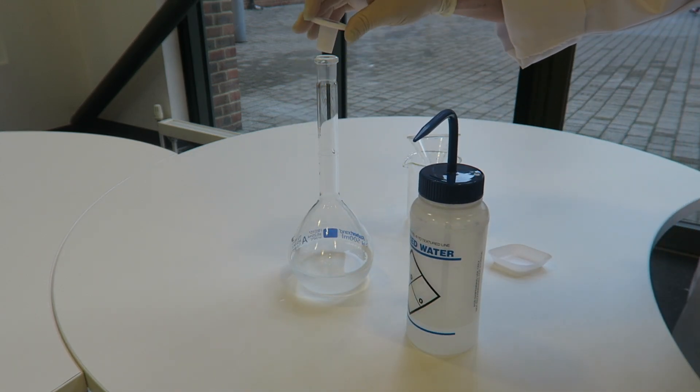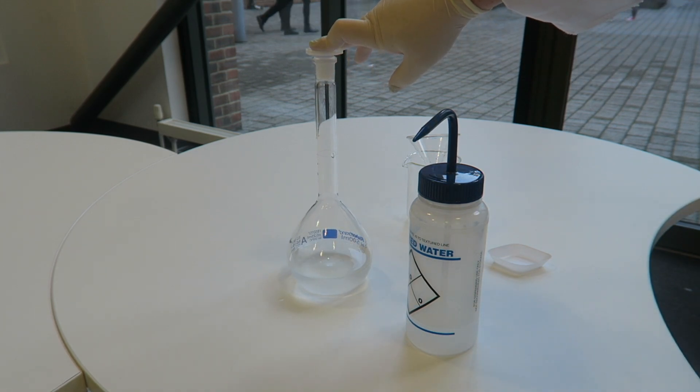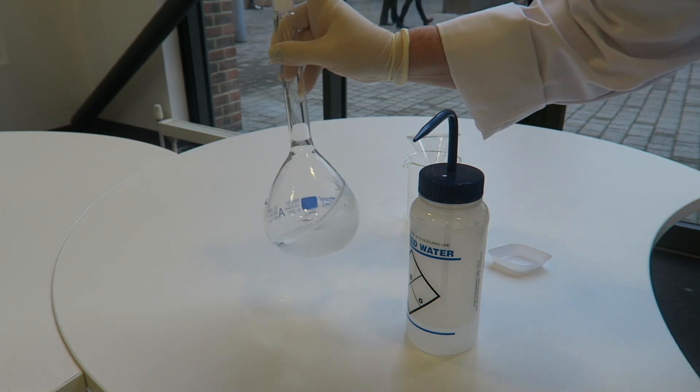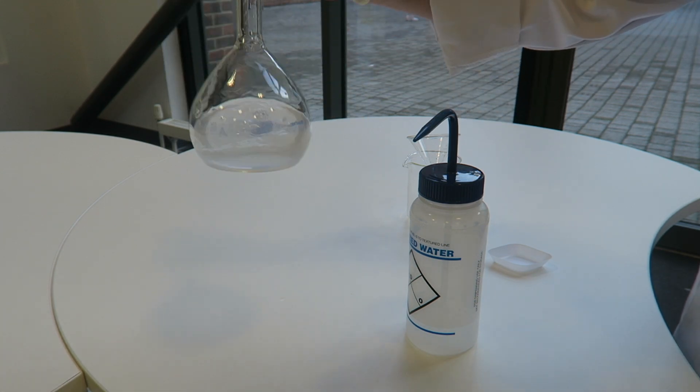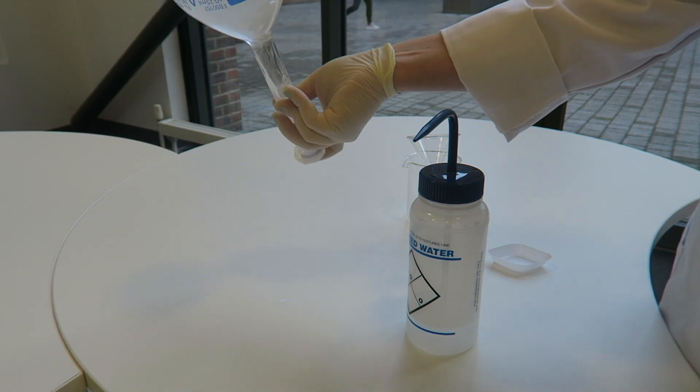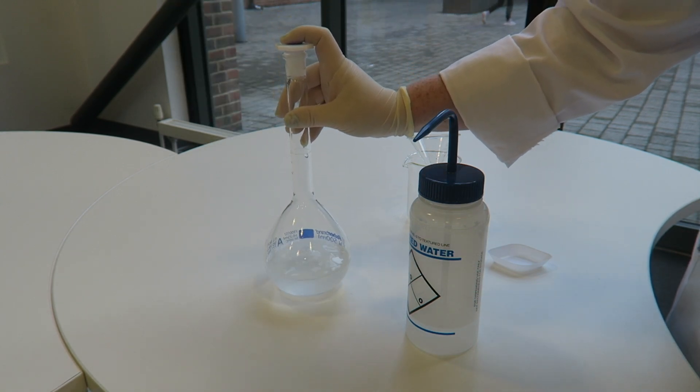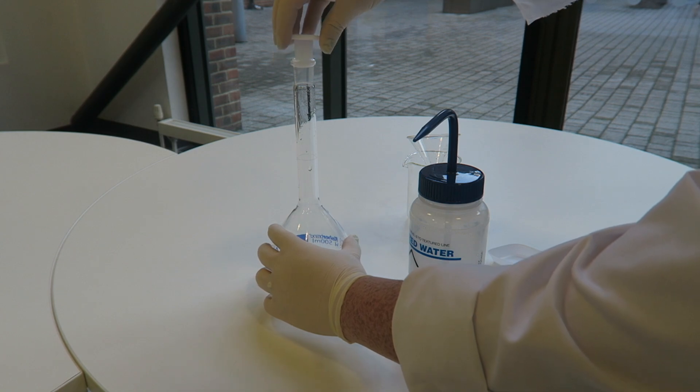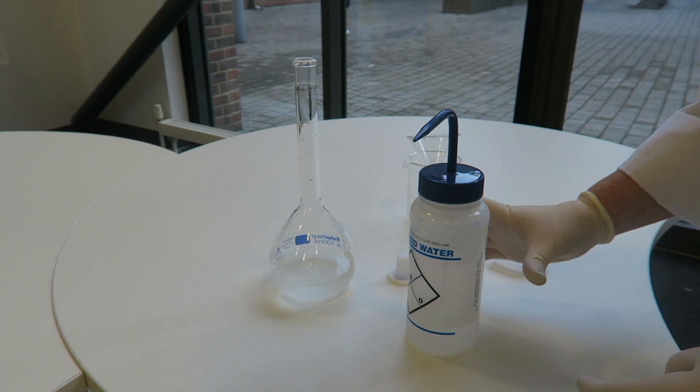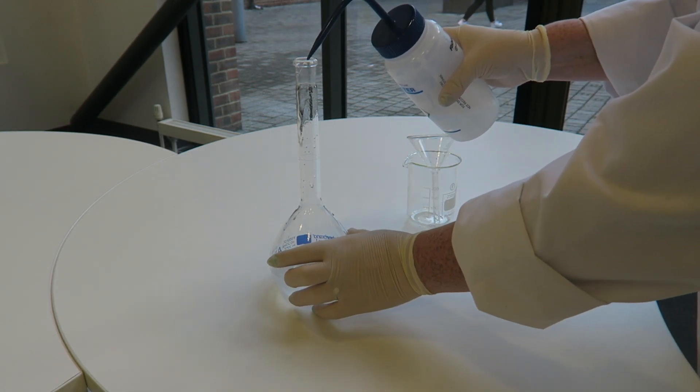What you can do at this point is to put the lid on. And if you think it needs a bit more mixing, then we can invert it. Again, what you need to do at that point is then clear any liquid that's on the neck.